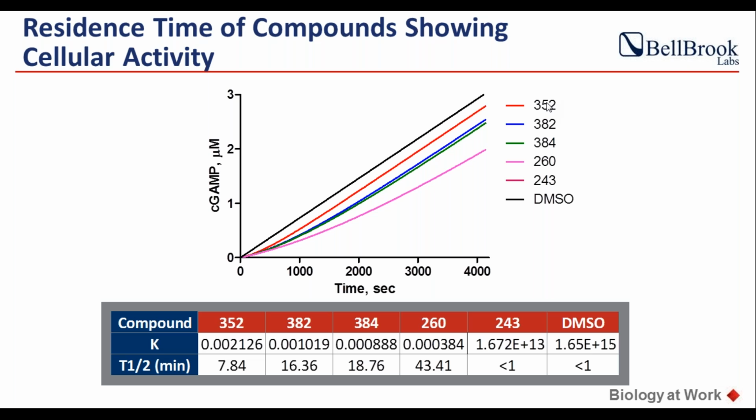So they are forming this EI complex. The enzyme is binding to the inhibitor. Give them some time, 30 minutes, 60 minutes. I do it for 60 minutes. 30 minutes should work as well. So keep the E and the I together, enzyme and the inhibitor complex together for 60 minutes.